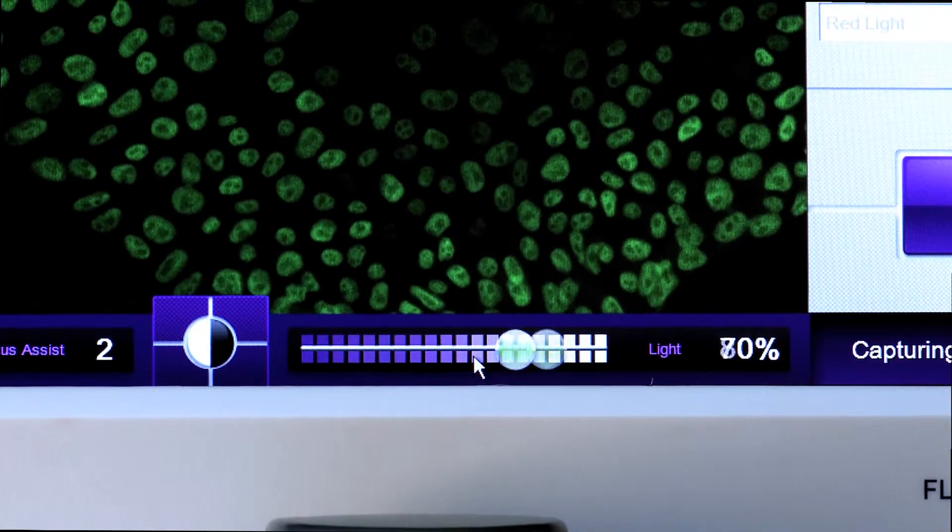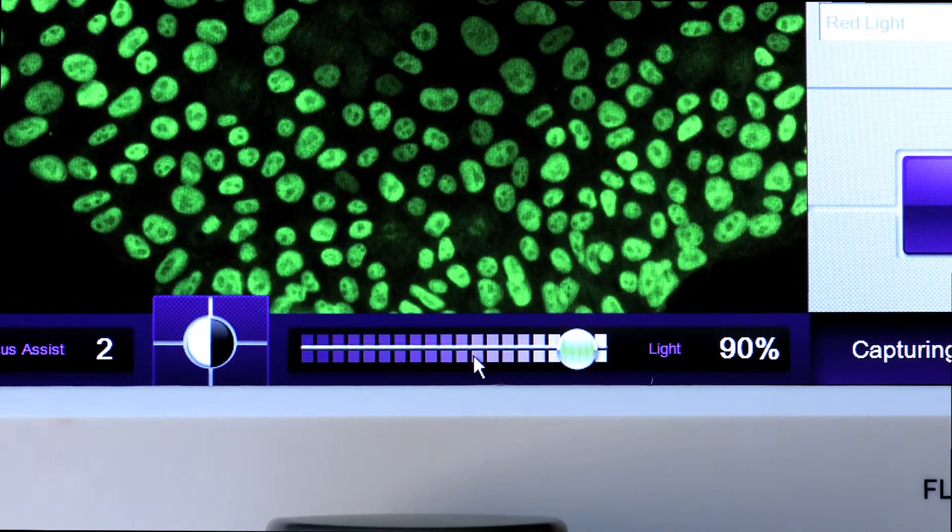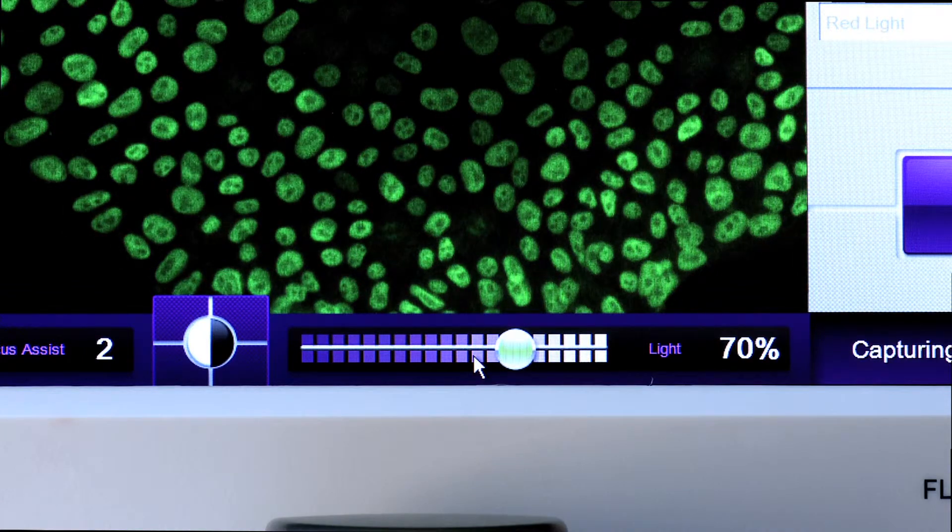With Floyd we integrated all the different parameters that control sample intensity into just one simple slider. You move it to the right it gets brighter, you move it to the left it gets dimmer — and that controls the gain, the exposure time, and the LED light intensity.